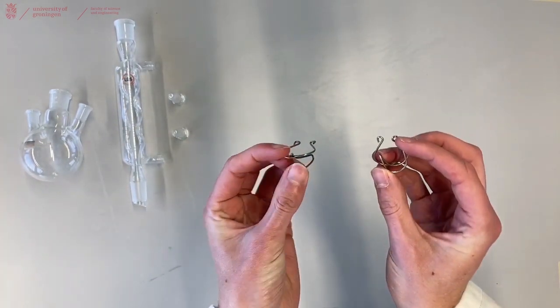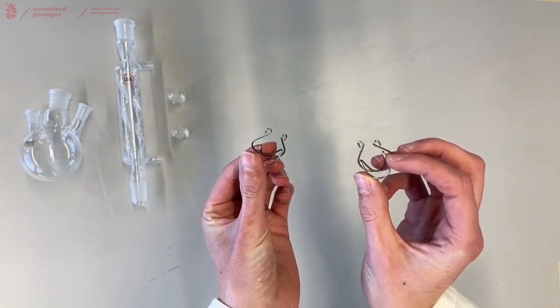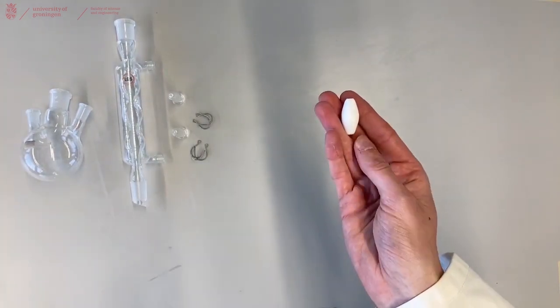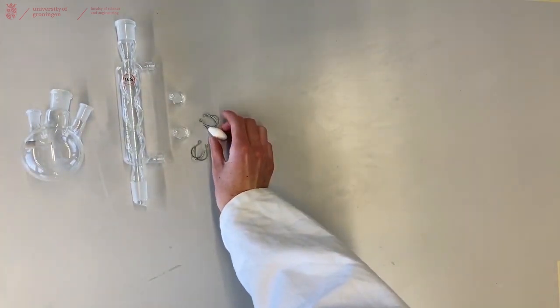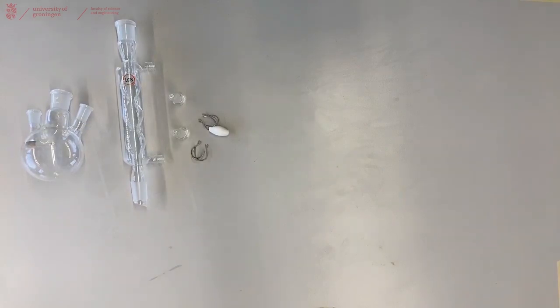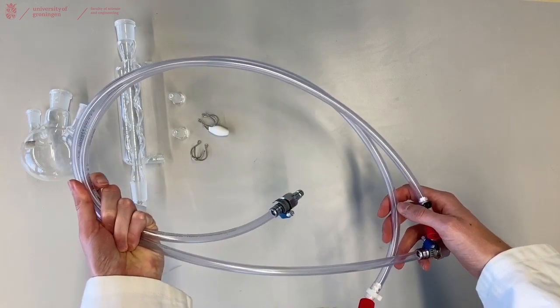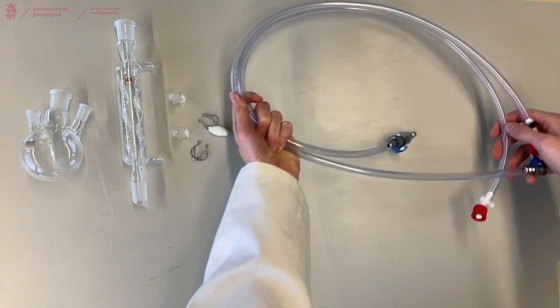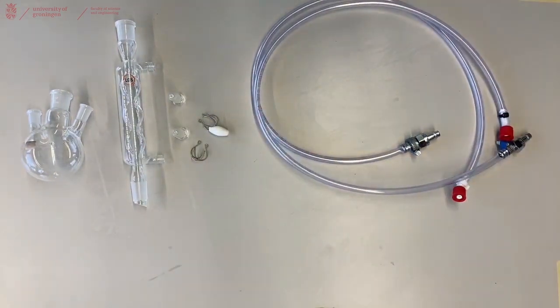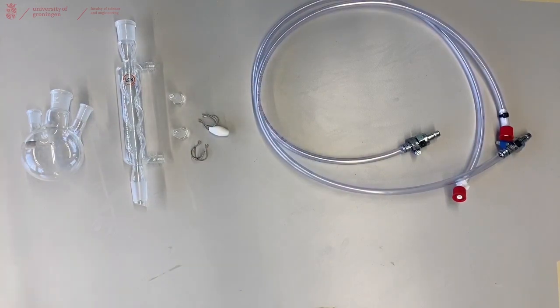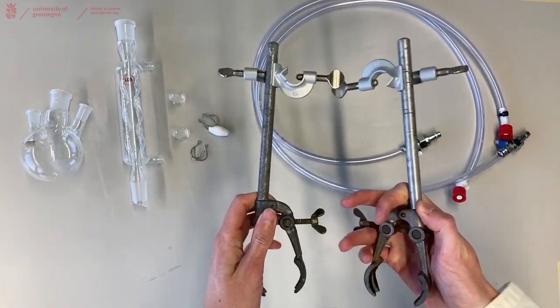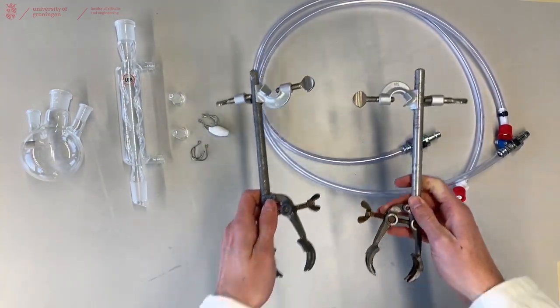You'll need two metal clamps to attach the stoppers to your three neck flask, a stirring bar to stir your solution, two water hoses to connect your condenser to the water, and two metal clamps to connect your glassware to your fume hood.